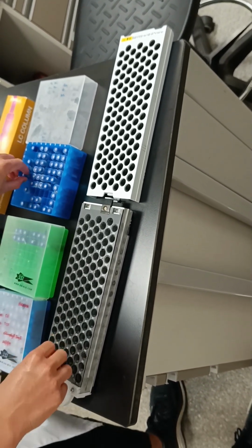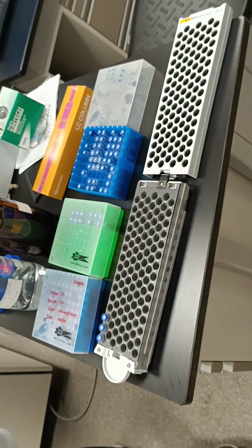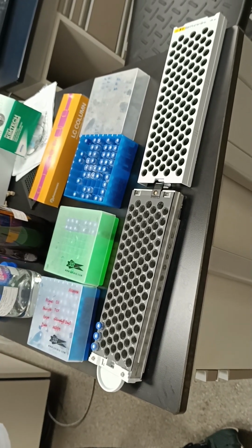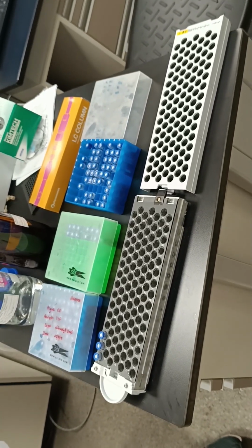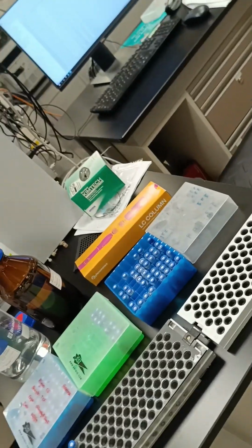No, I make my own QC samples. Remember I told you that we are working on all these leafy crops, right? For example, we deal with pak choy, and even pak choy has different subspecies. So how I create the QC samples is I take a representative, one or two, from each of the different subspecies, pool them together and mix the powder, and then split it into maybe 4 or 5 vials.